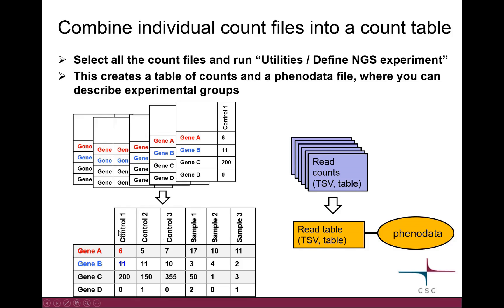Like what you see here, I have all my samples and counts for each gene in all these samples. So you get a table. But now, importantly, in addition to this count table you get another file which is called phenodata file. It looks a bit different in the workflow view. It doesn't look like a box but it's more like a little sort of ball, and it's attached to the count table. This means that this file actually contains information for the experiment, for the samples that are listed in the count table, so it has a specific function in Chipster.